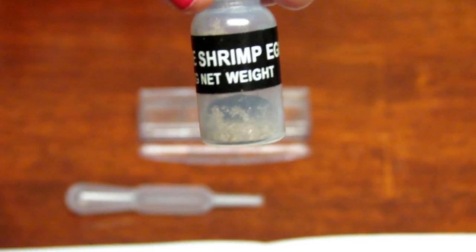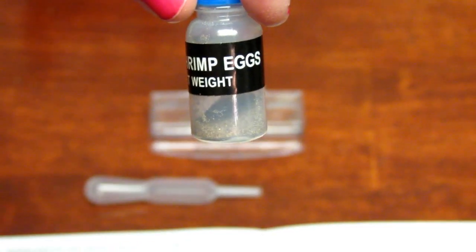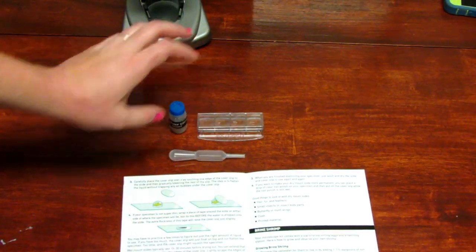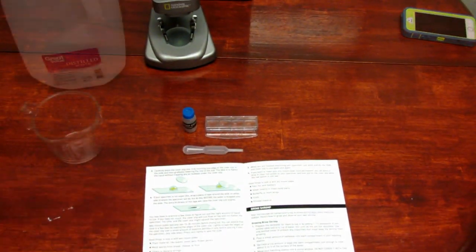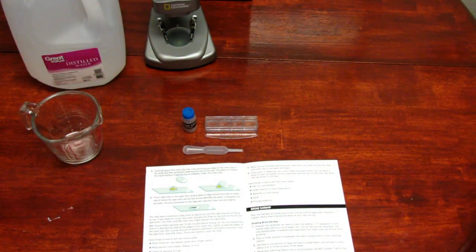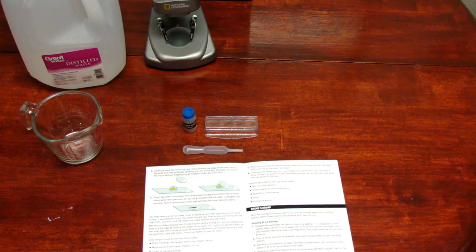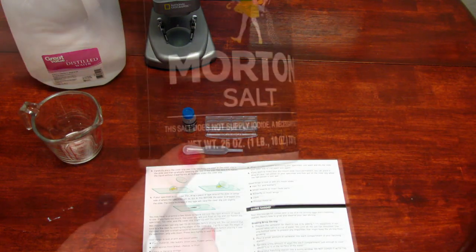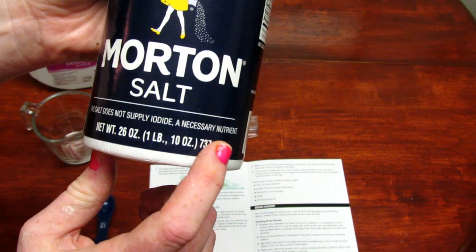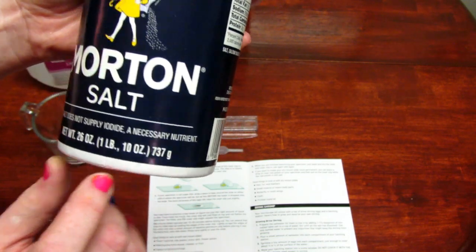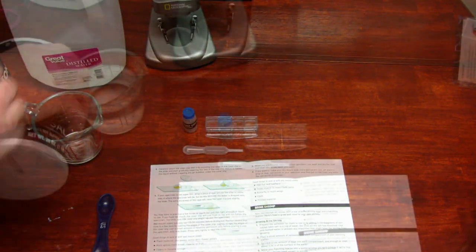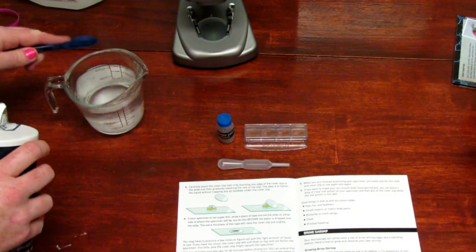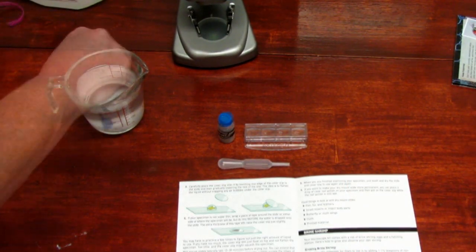This does come with a vial of brine shrimp eggs, also known as sea monkeys, for you to hatch. Now what you do is you're going to have to prepare the salt water, and you're going to use bottled water so there's no impurities in it. I had distilled water, and you need salt that is not iodized, non-iodized salt, and they're supposed to start hatching in 24 to 48 hours.